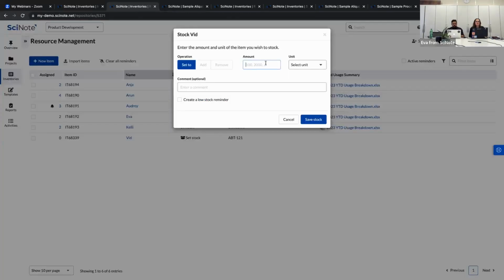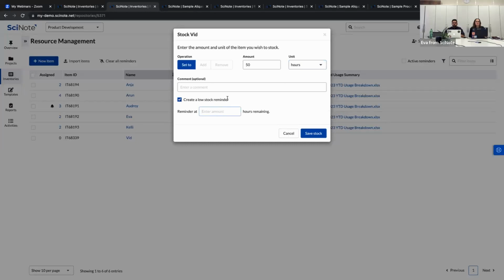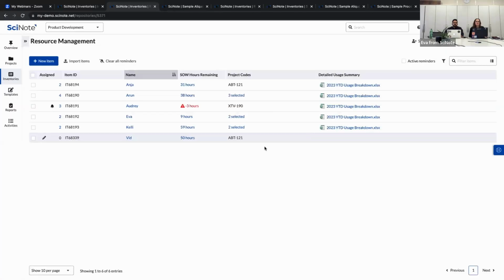So let's say for this project, we've budgeted 50 hours of Vid's time. If you want to create a low stock reminder, we can say remind us once we're down to 5 hours of Vid's time left. So now we have the starting stock of 50.